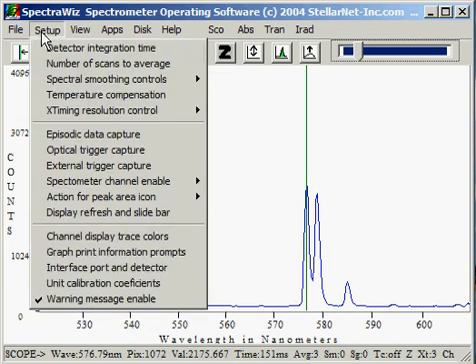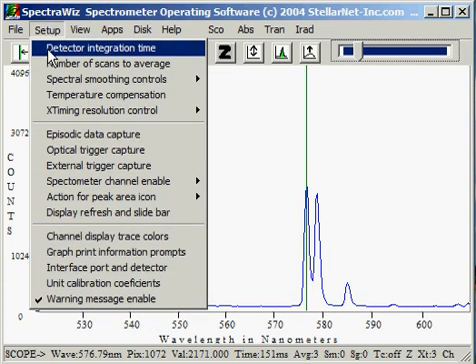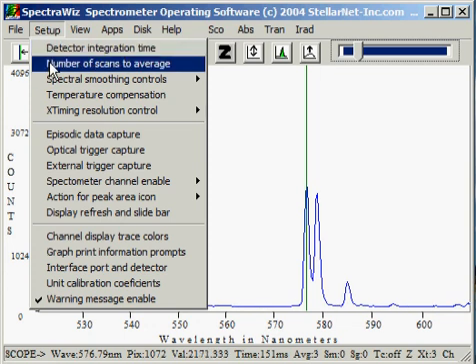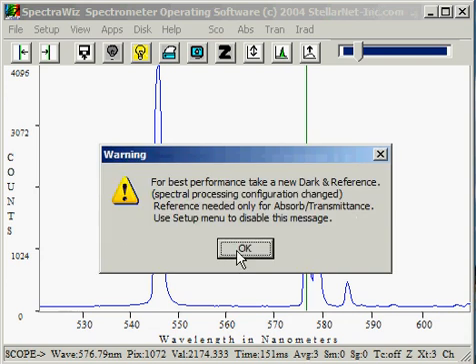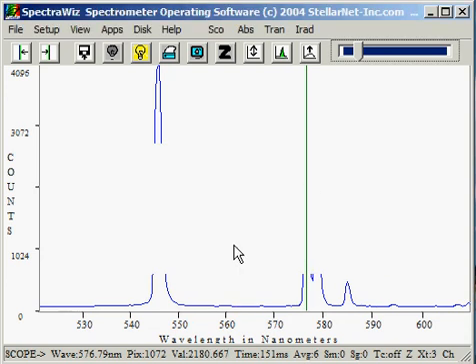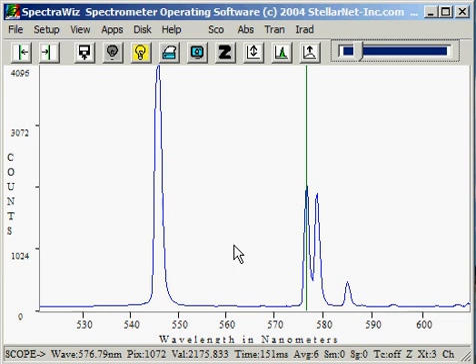We have seen the effects of increasing and decreasing the detector integration time to make a signal larger or smaller. The number of scans to average — in this particular example we have it set at 3. By increasing the number of scans to average, we effectively improve the signal-to-noise of the system by the square root of the number of samples we're averaging.